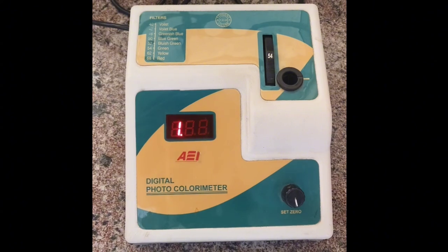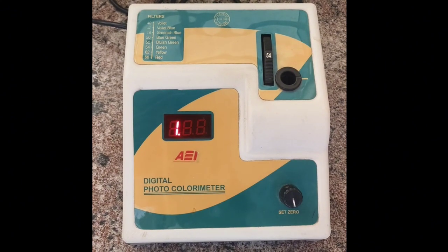The working of a colorimeter is mainly based on Beer-Lambert's law. This law states that the light absorption when passing through a medium is directly proportional to the concentration of the medium.